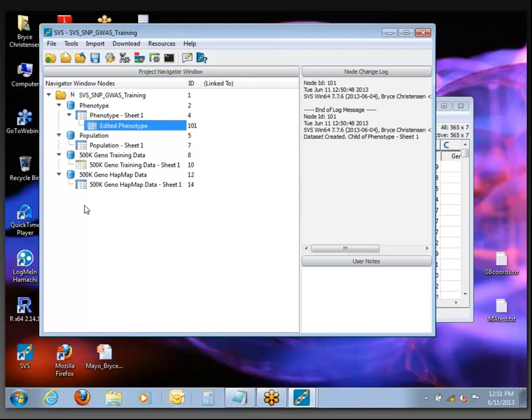Here we're going to demonstrate a few QA functions and a few plotting functions that we haven't seen yet today. The first thing we're going to do is look at sample call rates — Part 3A. Open up this spreadsheet that's called 500k genome training data.